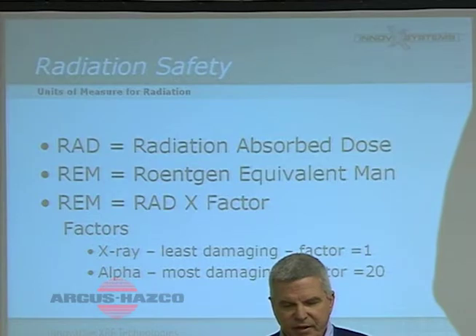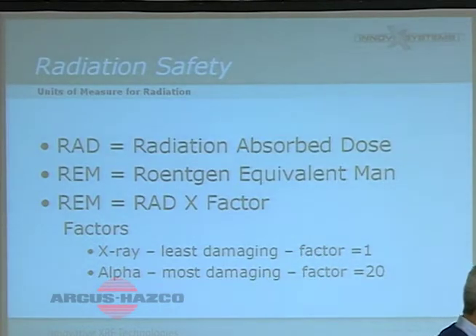They named it after Wilhelm Roentgen, who discovered X-rays, and I guess they decided to use his name for the unit of measure because he was a very bright guy, not just because he discovered X-rays, but when he was going to test out his new little invention, he was thinking about putting his own hand under there, and he goes, maybe not a good idea. He says, come here, dear. He used his wife, so she was the first one that had her hand shot. Okay, I don't know what happened to her.